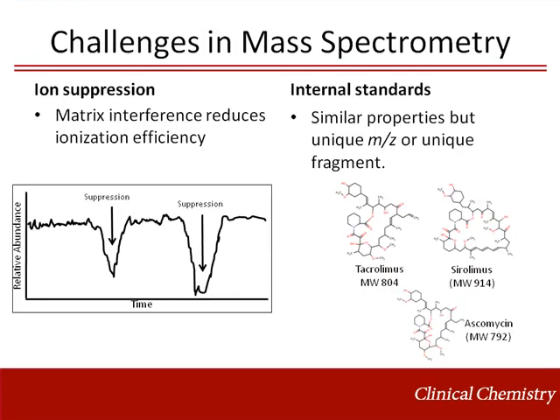Ion suppression occurs when something in the sample interferes with the ionization process of the analytes. For example, non-volatile or less volatile components found in the sample can inhibit proper droplet formation or efficiency of solvent evaporation. One method for determining ion suppression is a T-infusion experiment: analyte is infused into the mass spectrometer at a constant rate while a sample that does not contain the analyte, but is an appropriate matrix match, is injected. The sample tracing should be a constant line in the absence of ion suppression, but the relative abundance will appear to drop when ion suppression is occurring. Better sample preparation and improved chromatography are two possible solutions to reduce ion suppression.